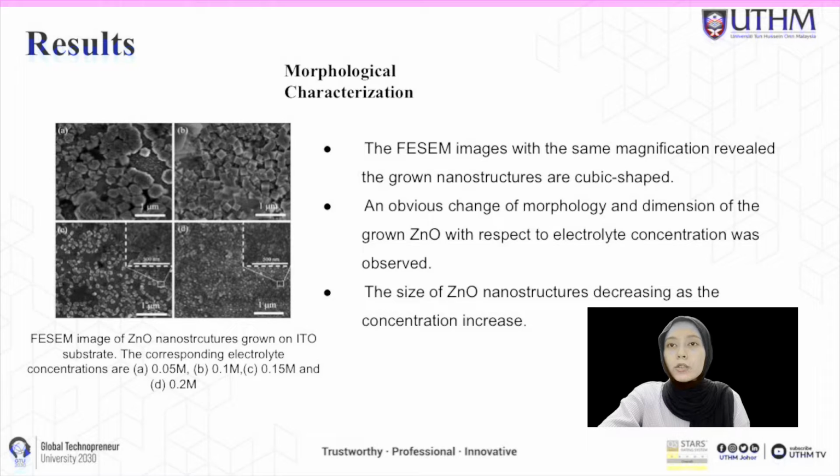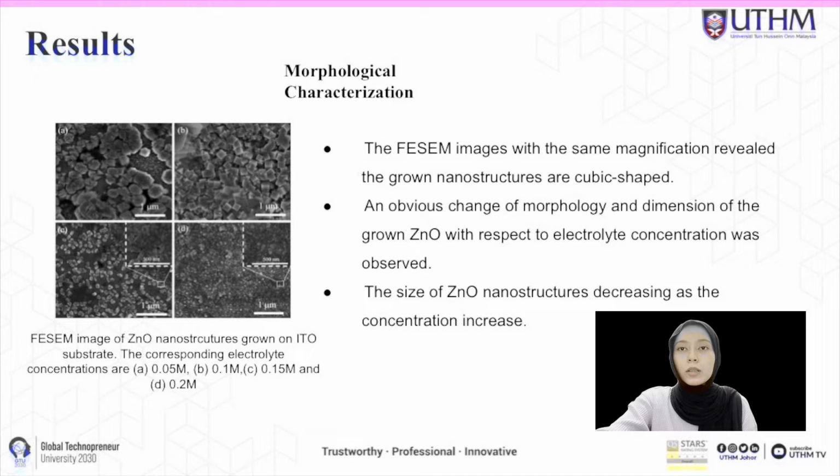An obvious change of morphology and dimension of the grown zinc oxide with respect to electrolyte concentration was observed in this paper. The size of the zinc oxide nanostructures decreased as the concentration increased.